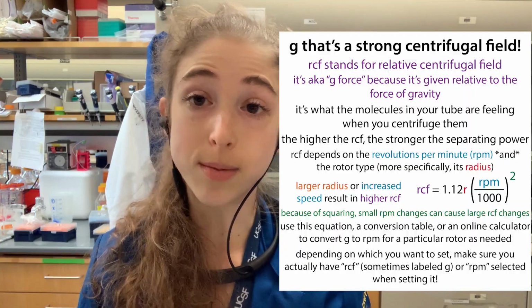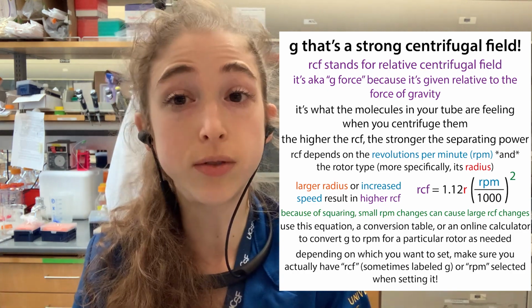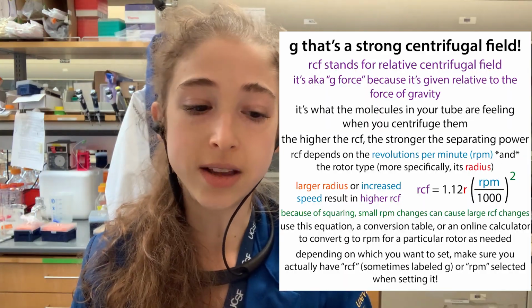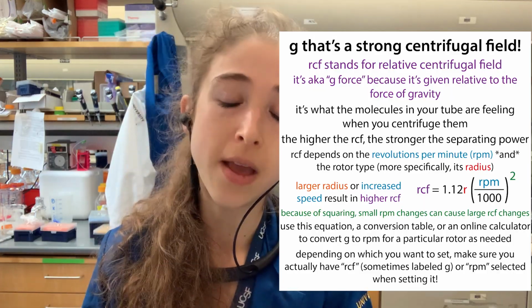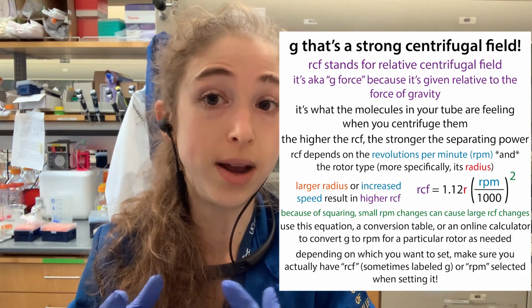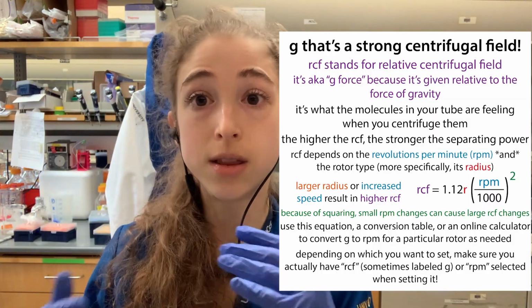So remember that the force that's being felt, we often talk about this as the G force, because the relative centrifugal field is going to be relative to the force of gravity. And often you see it without the thousands. So if you see something like 40, that's not really going to be 40, it's going to be 40,000 G. And that's going to depend on both the rotor and the speed at which that rotor is moving. And so the further away you are, the longer the radius, the bigger the force that's going to be applied.